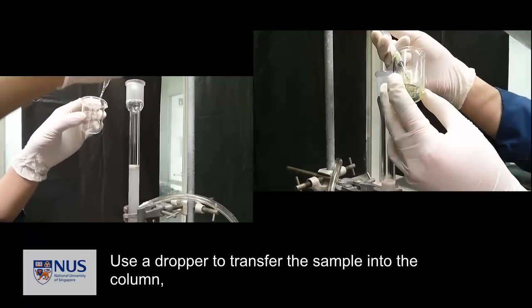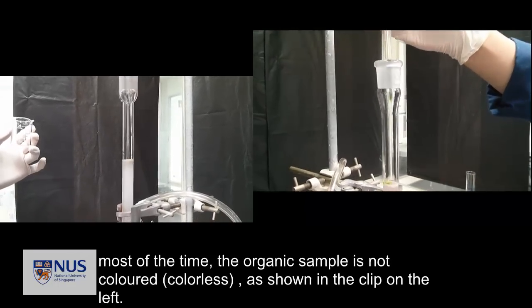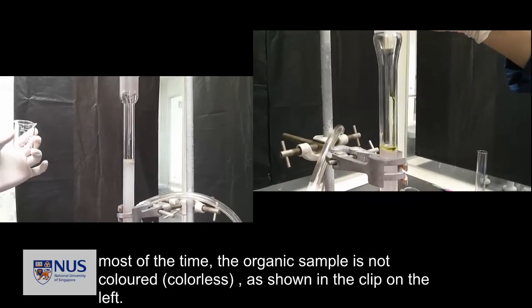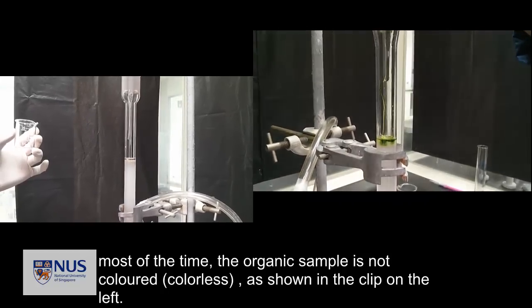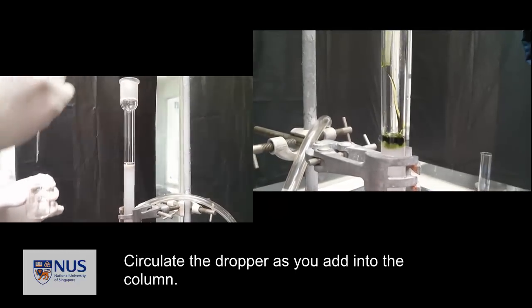Use the dropper to transfer the sample into the column. Most of the time, the organic sample is not colored as shown on the clip on the left.